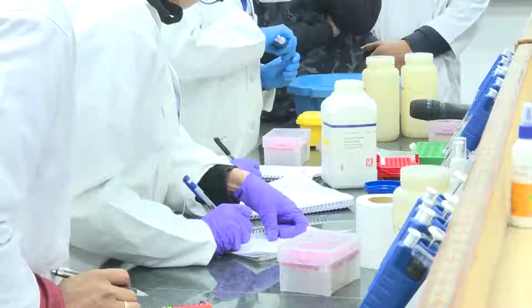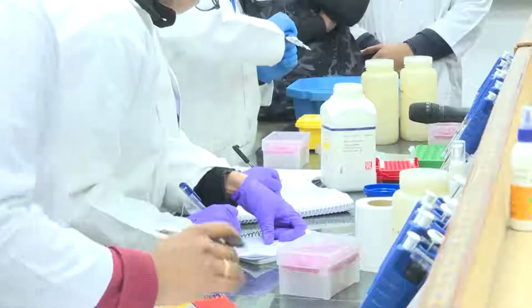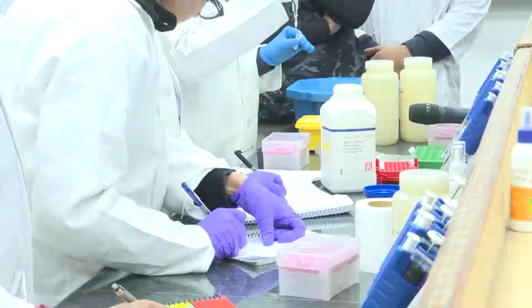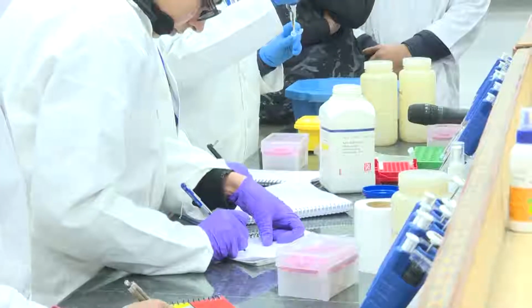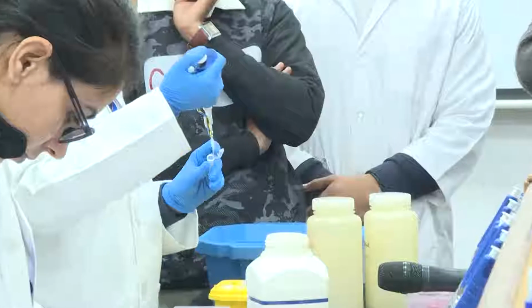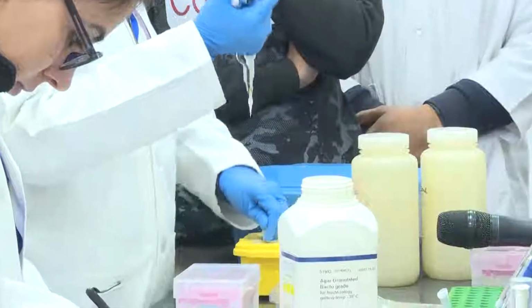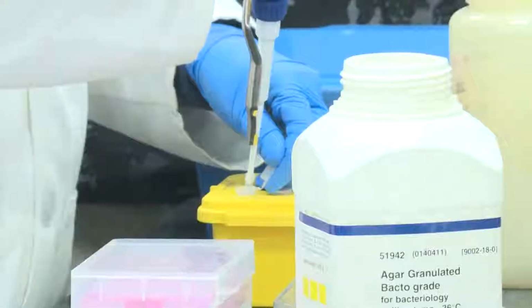We have two formats or types of PCR cups for the Roche machine. One is known as the multi-well plate, which is a 96 well plate. The other one is PCR strips, 8 well PCR strips. For this class, we are using only the 8 well strip.